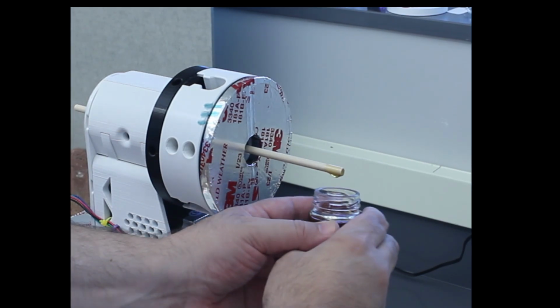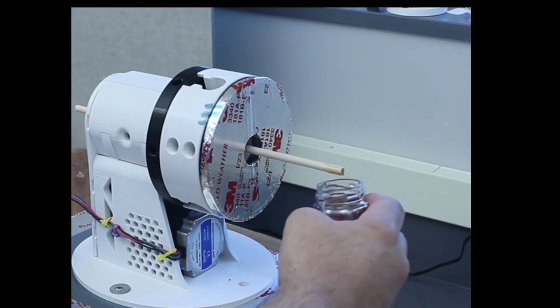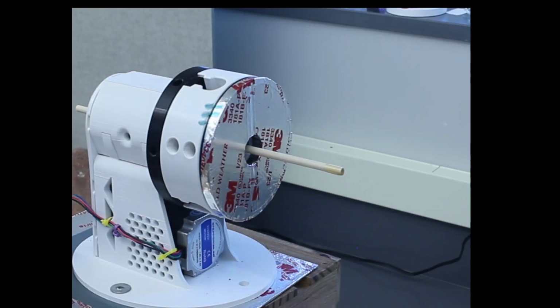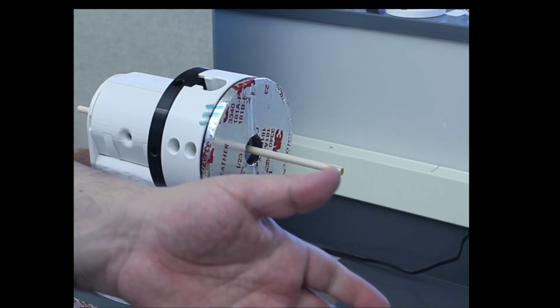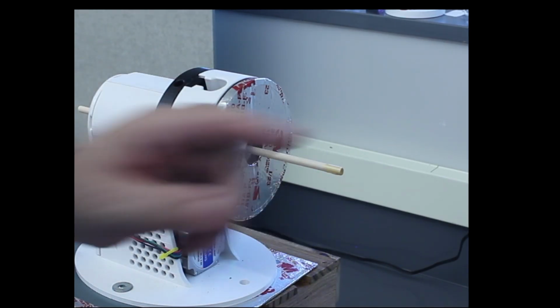But like I said, this might seem silly, but I make all my students practice this with the stick in their hand, not the lathe, before I let them get on the torch. Because if you can't control a stick with honey on it, do you really want to have an open flame and a piece of glass and panic? So there we go.